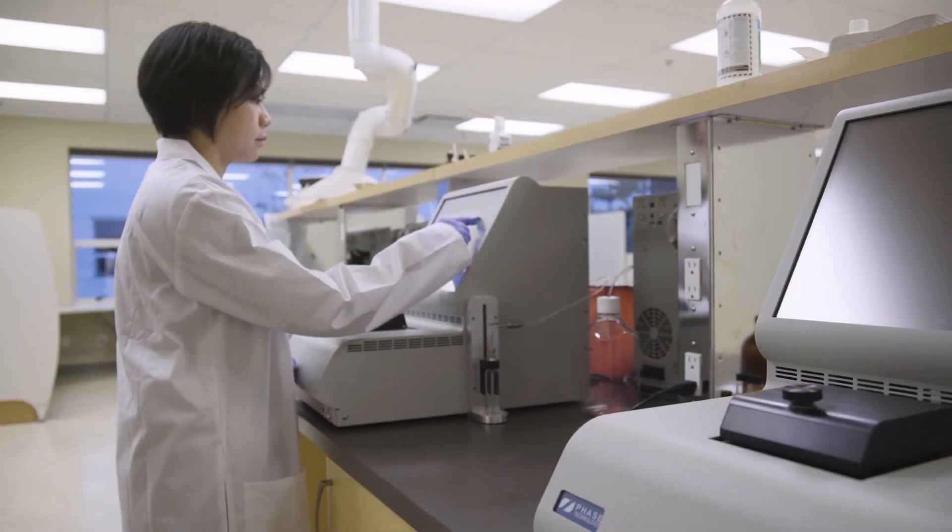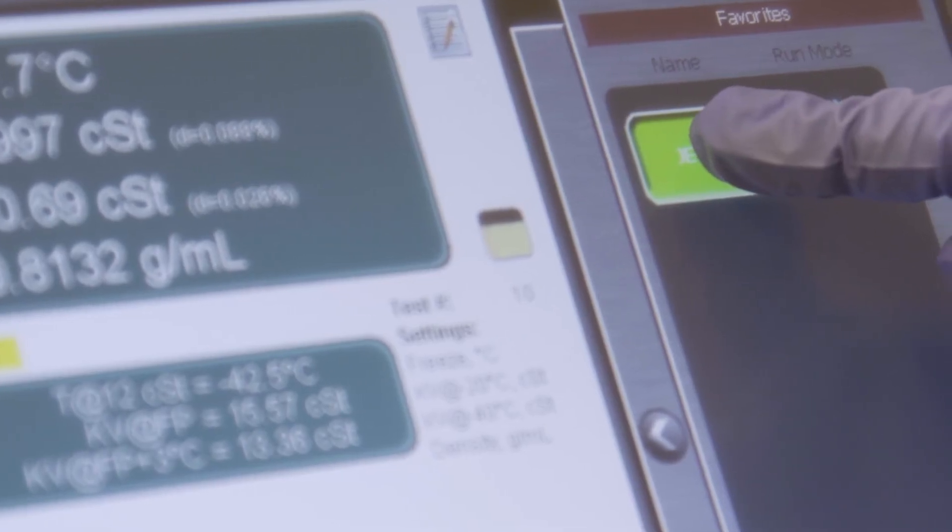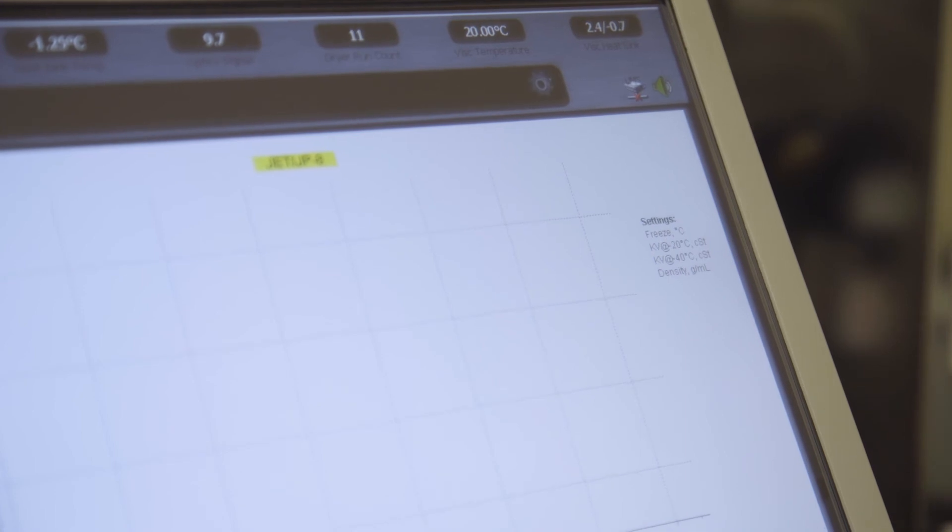To start a run using a predefined test setting, press and hold one of the favorites buttons for two seconds.